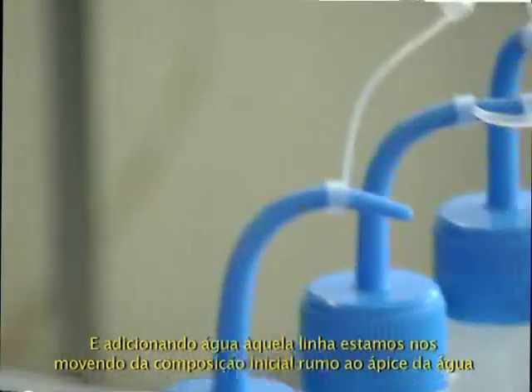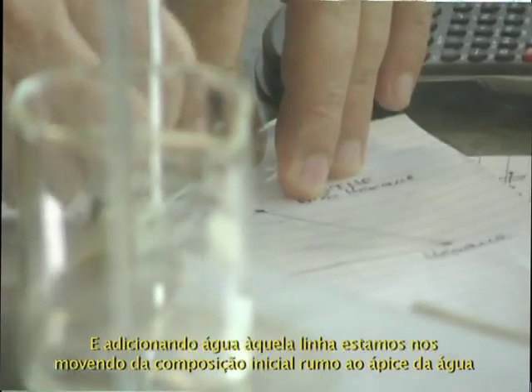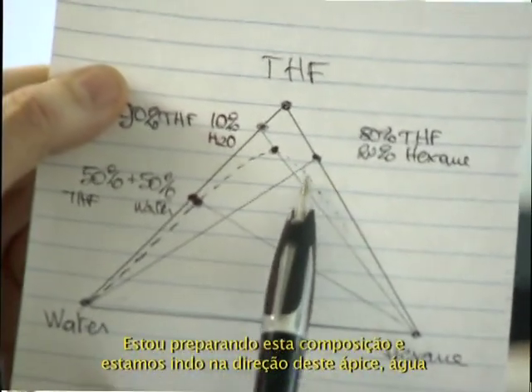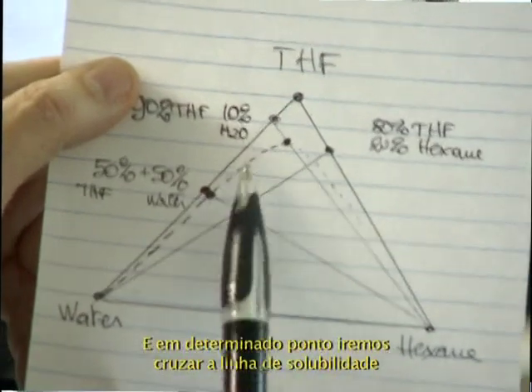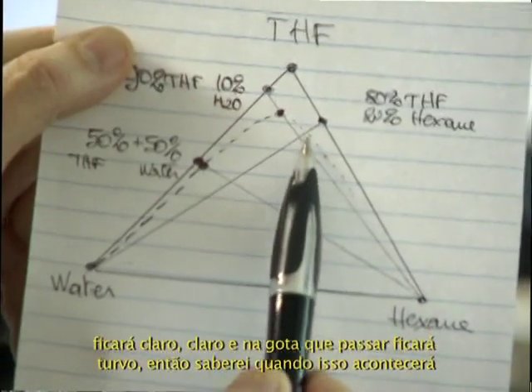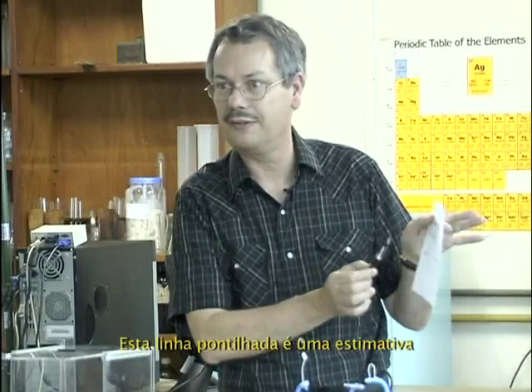And adding water to that line, we are moving from the initial composition toward the water apex. So I'll prepare this composition, and we are moving towards that apex, water. At a certain time, we will cross the binodal curve. That will be clear, clear, clear. At the drop we cross, it becomes cloudy. So I will know where this line is. This dotted line is an estimate I just put.